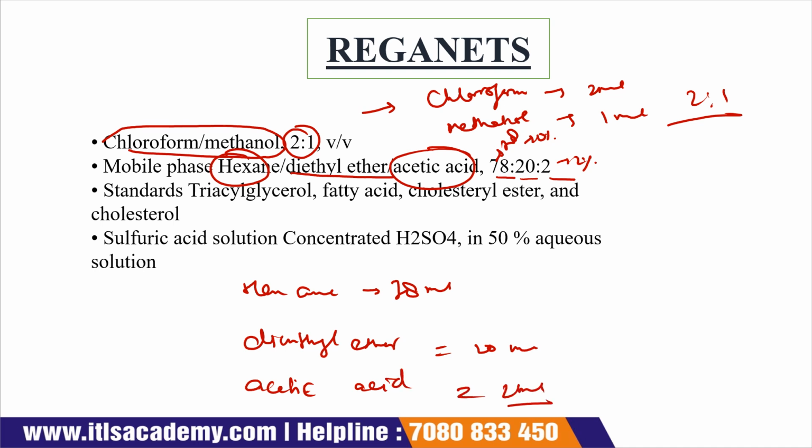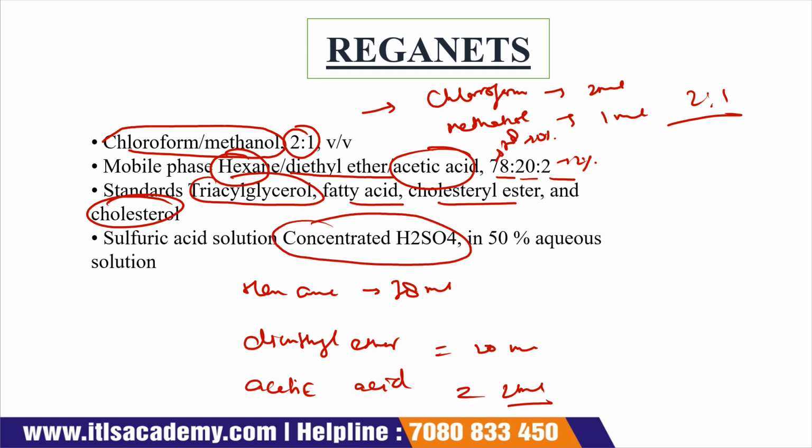Okay, and we also have standards of triglycerol, fatty acid, cholesterol ester and cholesterol. We also have a solution of concentrated sulfuric acid in 50% aqueous solution. So these are the list of the reagents that we use when we perform this experiment.